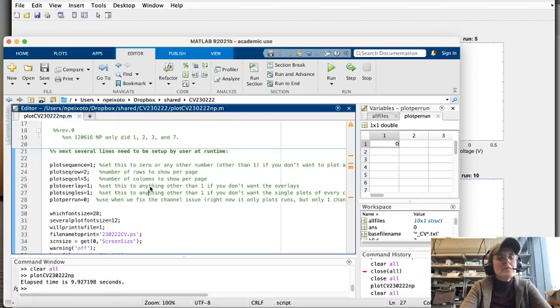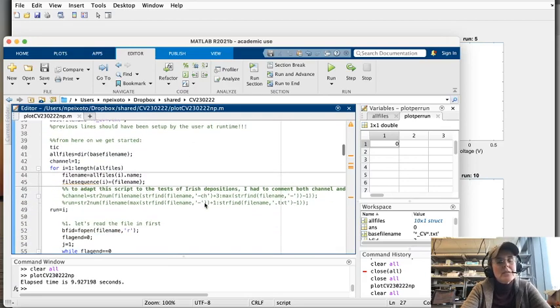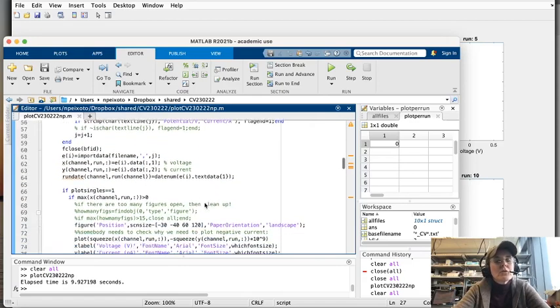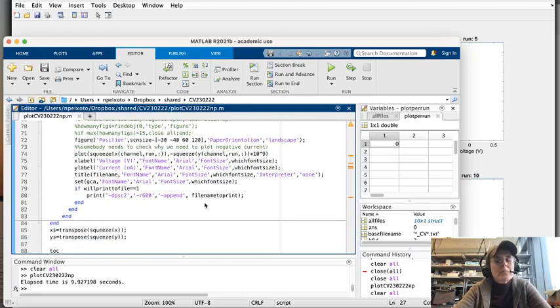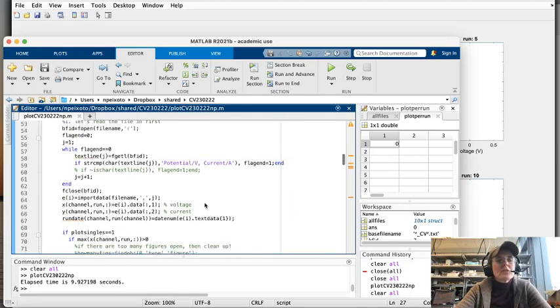But I had expected the channels to be with an underscore. This particular .m file is not finding the channels as part of the file name because it was -ch instead of _ch. So that is not going to work.